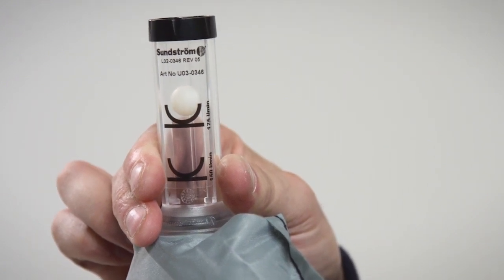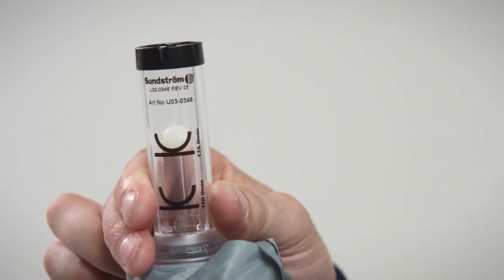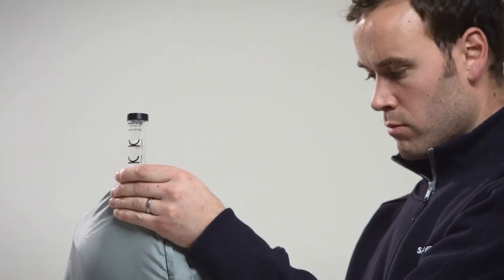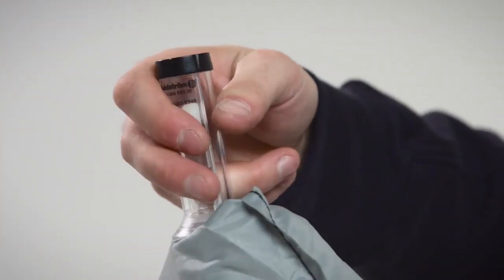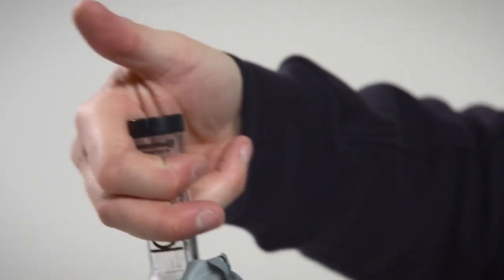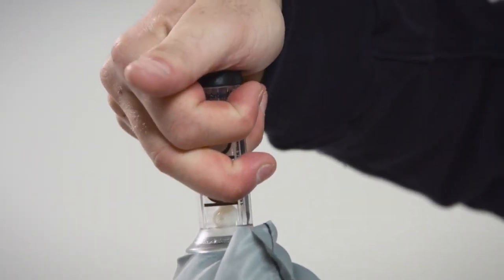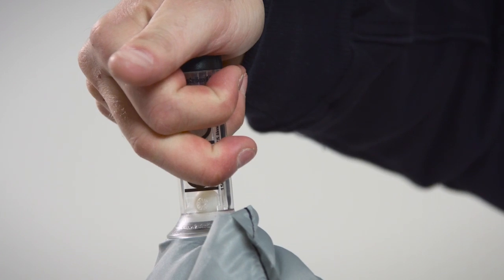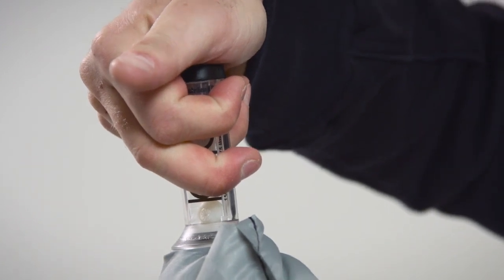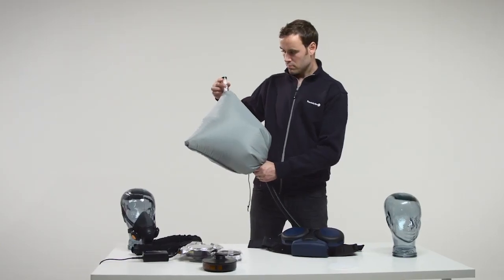Checking the alarms. The equipment is designed to provide a warning if the airflow is obstructed. Provoke an airflow stoppage by gripping or shutting off the flow meter outlet. The fan unit should then initiate alarms by sound, light signals and vibrations.